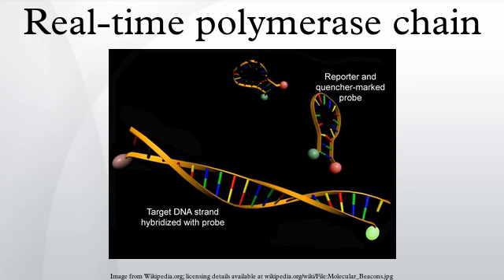Breakdown of the probe by the 5' to 3' exonuclease activity of the Taq polymerase breaks the reporter-quencher proximity and thus allows unquenched emission of fluorescence, which can be detected after excitation with a laser. An increase in the product targeted by the reporter probe at each PCR cycle therefore causes a proportional increase in fluorescence due to the breakdown of the probe and release of the reporter.